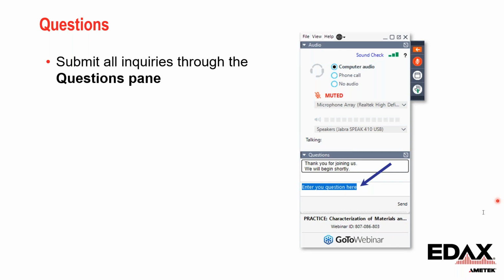Yeah, I think I have time for one more question. Okay, on one of the slides, you mentioned your detector utilized lower beam currents to prevent beam damage. Why can the beam current be lower?